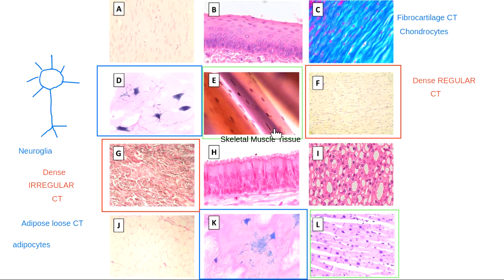This is one individual cell that I can see here. Here's another individual cell, and there's one over here. Yeah, it does kind of look like hair, right? The way that hair would look on a microscope. When I'm looking at these skeletal muscle cells, the reason that this is my favorite view of it is, see all of these little dots that I see on this type of tissue here? All of these little dots that I'm looking at are nuclei.